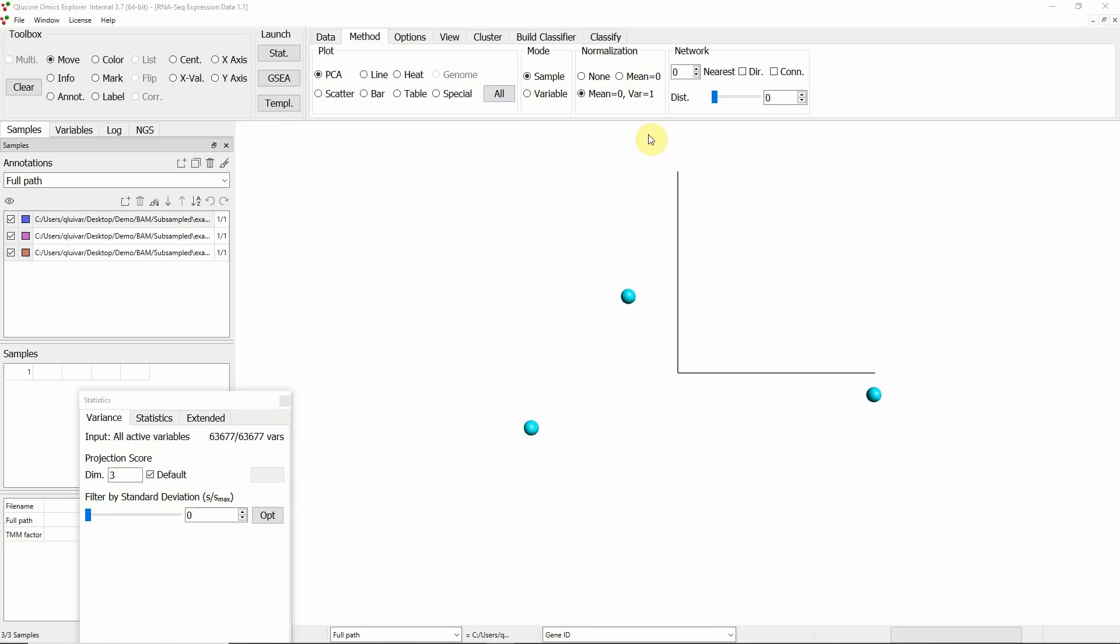With the optional license for the NGS module, you can also study your RNA-seq data in the genome browser or use the FusionGene workbench to summarize.